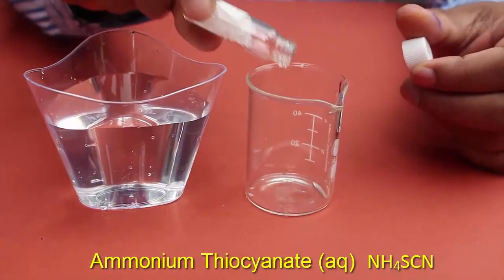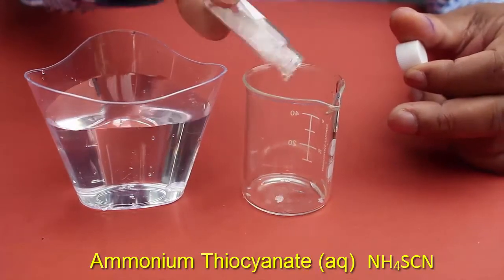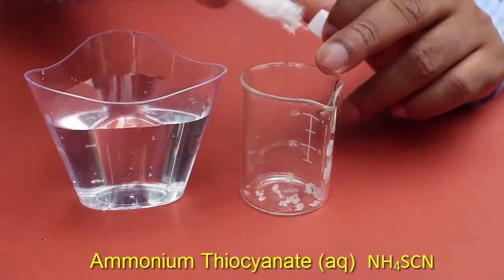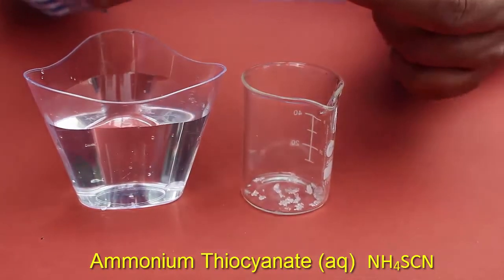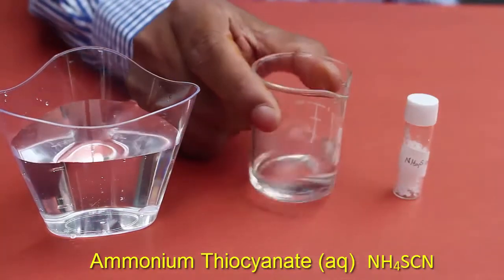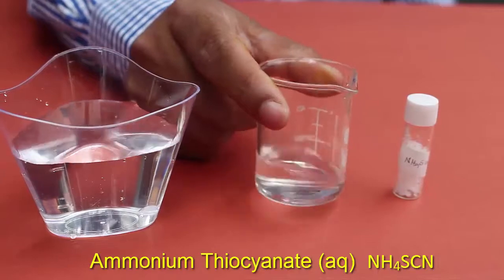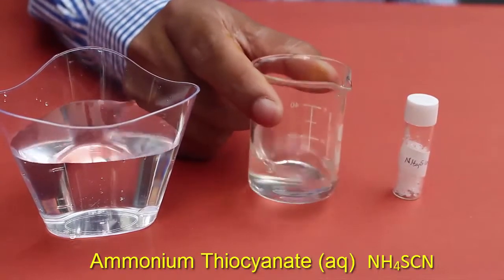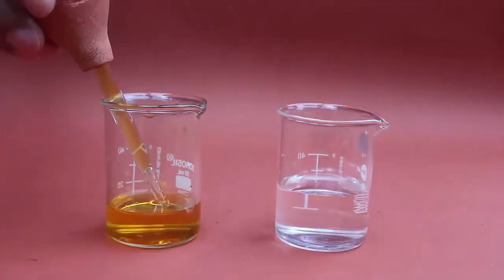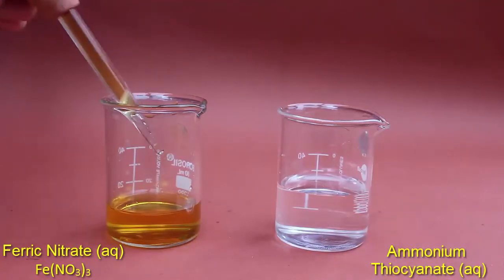Now in the same manner we will prepare a solution of ammonium thiocyanate. Add a few crystals of ammonium thiocyanate into an empty beaker, then add a bit of water and stir the mixture until the crystals dissolve. This chemical is quite easy to dissolve in water, and the solution of ammonium thiocyanate will be transparent.